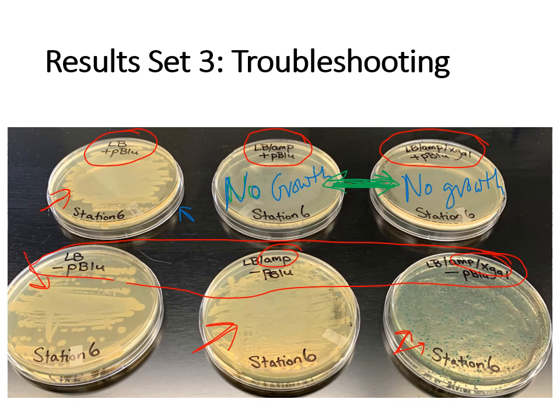When you streak the plate, again, that cover, you always clamshell it, meaning if you have a plate and you're opening the cover, you only open the cover at like a 45-degree angle, so that would be the cover, this would be the bottom of the plate. You never completely separate the cover from the plate, so clamshelling is very important.